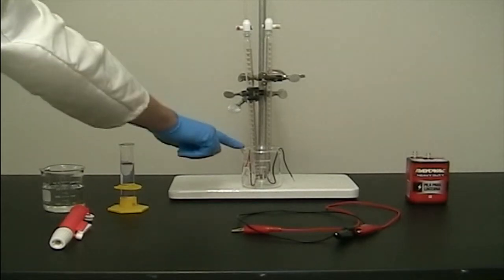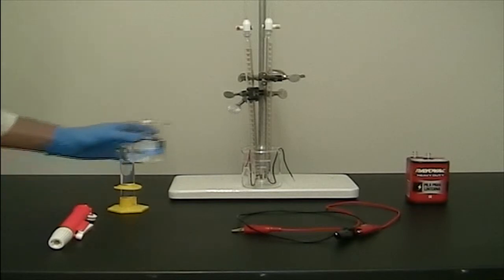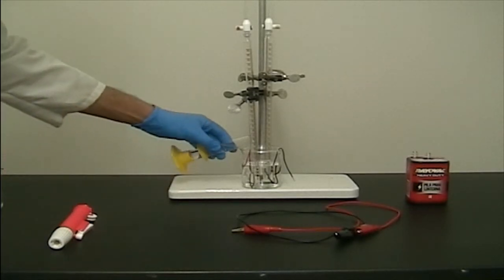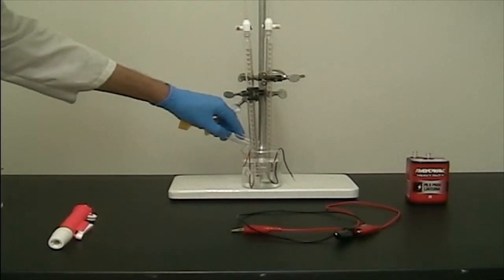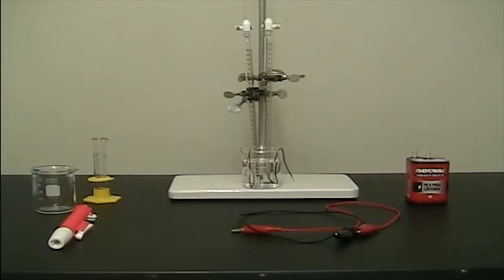To the 250 milliliter glass beaker were then added 150 milliliters of distilled water, followed by 25 milliliters of 5-normal aqueous sodium hydroxide. Students then waited about 3 minutes for dispersal of the ions into solution.